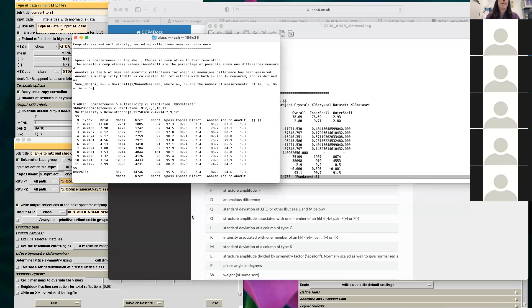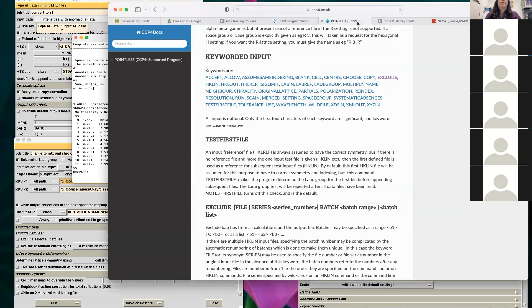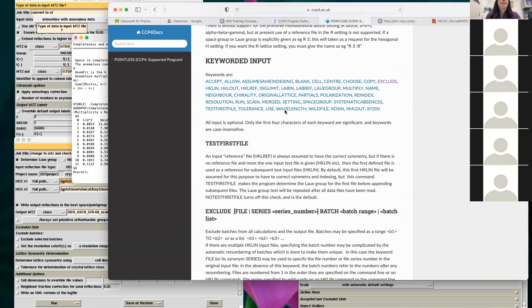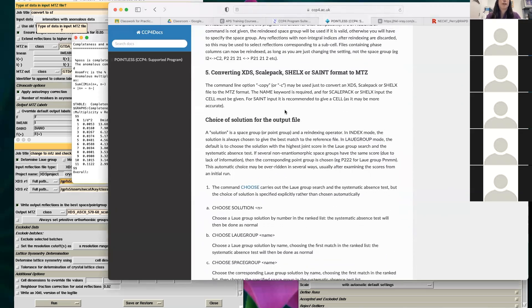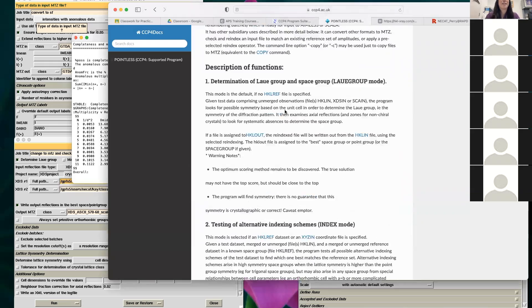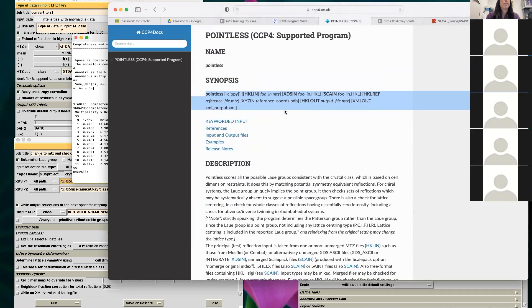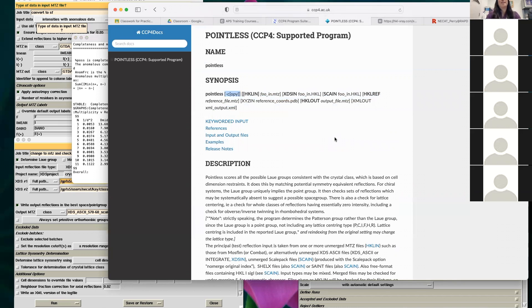There is a command line option in Pointless for copying and converting without checking — but I almost always like to use it and check to make sure you're in the right space group. The space group check is what is most powerful about Pointless, and that's why I always use it for the conversion.